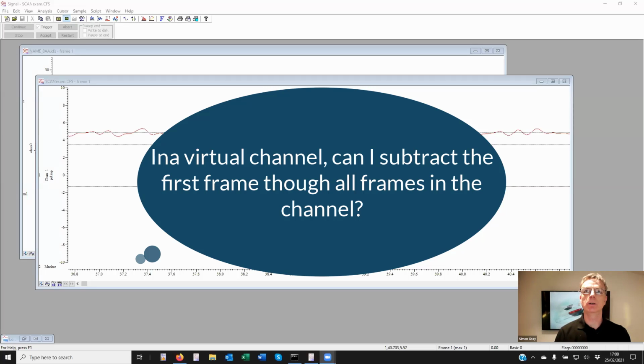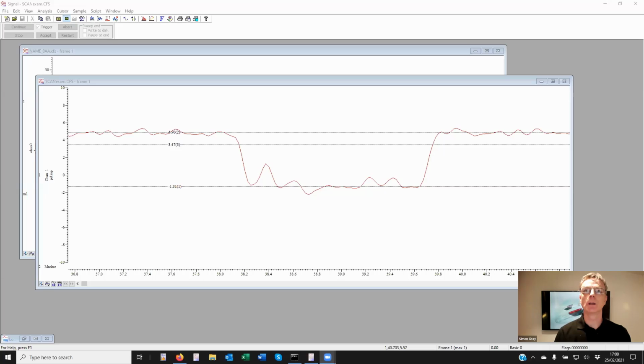Okay, we got a question. In a virtual channel, can I subtract the first frame through all frames in the channel? Now, a virtual channel is calculated from data in the current frame. It doesn't cross frame boundaries.